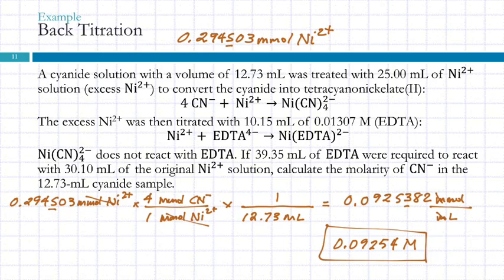So would you write all of this out by hand? No. You would write it out once, and then you would stick it into an Excel spreadsheet and let Excel do all the calculating for you. But you need to be able to show that it's true before you just start wildly calculating things. Make sense?